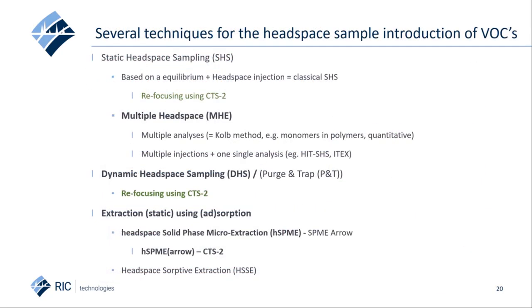This summarizes the different headspace techniques we have in our toolbox. No need to discuss all in detail here, but just note with this slide the possibilities of injecting multiple times a headspace amount of the same sample and trapping the volatiles, generating one single chromatogram for these multiple injections.